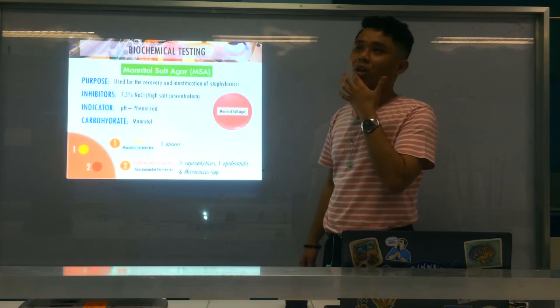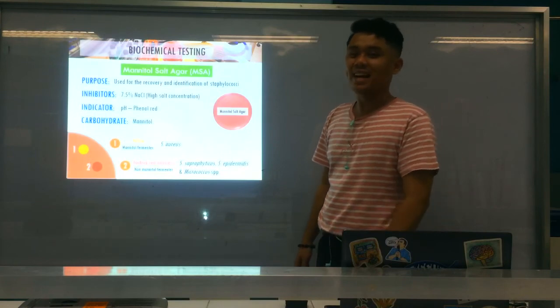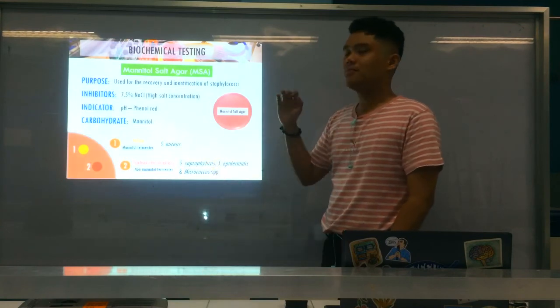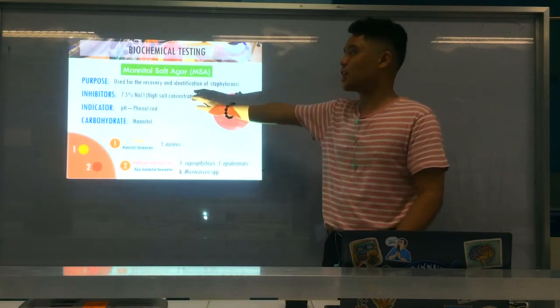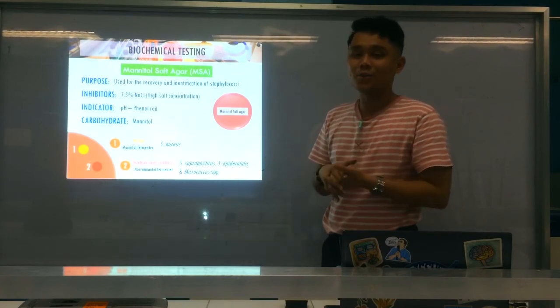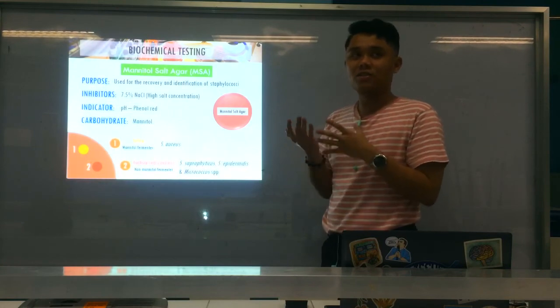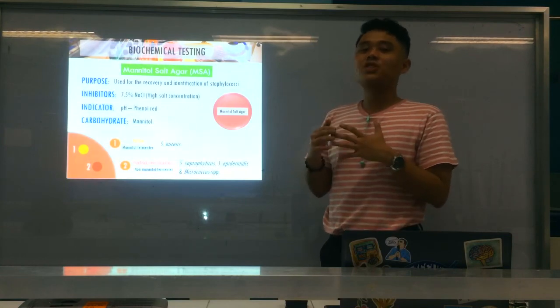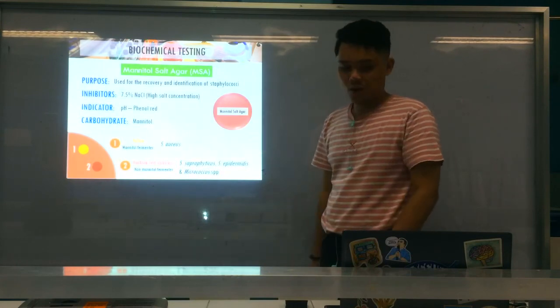Now, again, there are some Micrococcus species that can also grow and tolerate 7.5% NaCl. But again, most of the time we do this for confirmation of the presence of Staphylococci, because they are the ones that are really halophilic and can tolerate such high salt concentrations. And again, if there are yellow colonies on mannitol salt agar, don't think twice. That's your Staph aureus. Why yellow? Because Staph aureus ferments mannitol, and since fermentation results in acids, it changes the pH indicator from red to yellow.